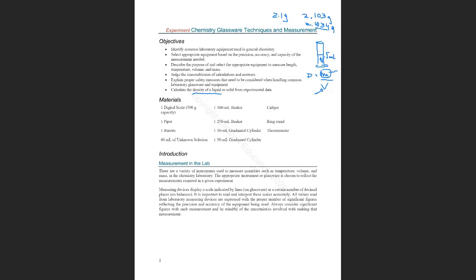If you use a graduated cylinder, you will have one kind of precision, and you will say, okay, maybe the volume is 5.0 mLs. And you can measure with a buret, and you can say 5.02 mLs. Obviously, if you have 5 mLs and your liquid is water, you cannot have 2 grams because the density is about 1. But it doesn't matter, it's a different liquid. So this is all what you are going to learn at the end of this workshop.